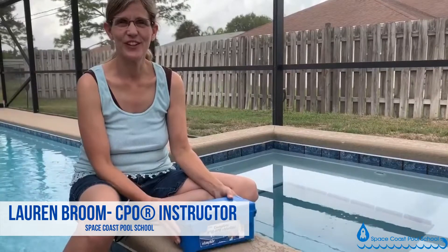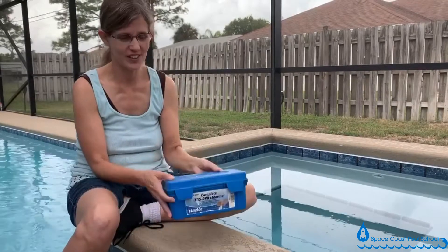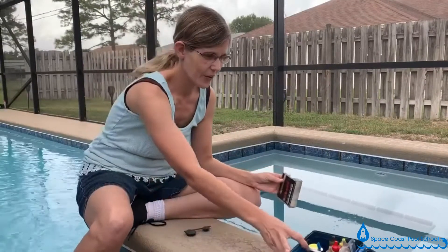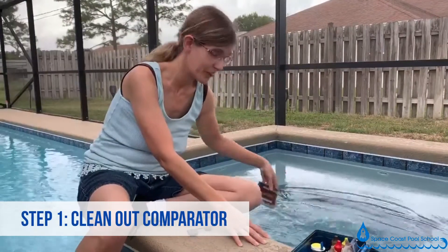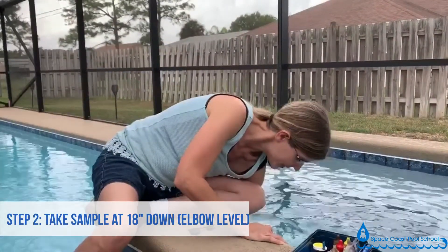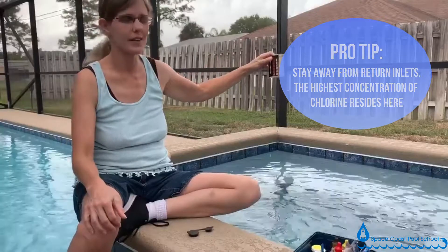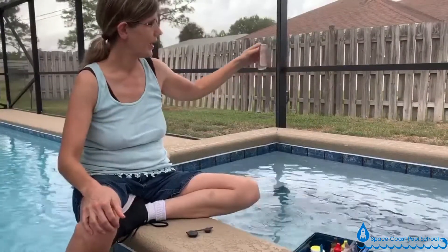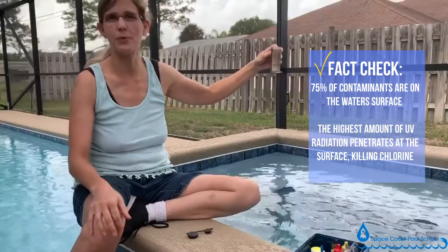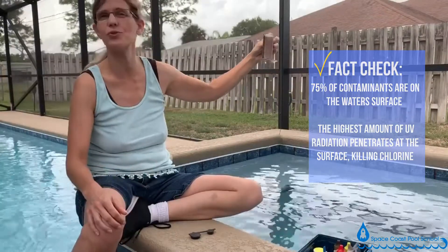Hello everybody, this is an instructional video on proper water testing with a pool test kit. We're going to test for chlorine level first — this is a spa. I'm going to take my comparator and go 18 inches down, theoretically to the elbow, staying away from return inlets on the side wall because that's where your highest disinfectant level is coming in. We collect 18 inches down because 75% of contaminants are on the surface, and UV radiation kills the most chlorine at the top, so that's not a true sample.